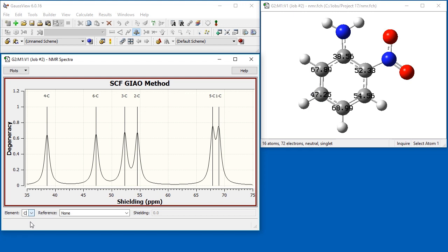You can limit the displays to a single element by selecting it from the element drop-down below the spectrum. Here, we focus on the carbon atoms within the molecule. If you are interested in chemical shifts rather than raw shieldings, you can compute them by selecting an item from the reference drop-down.